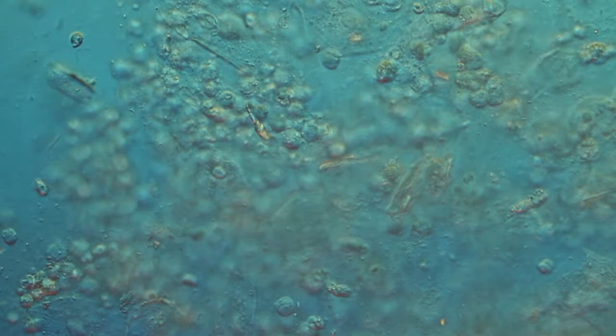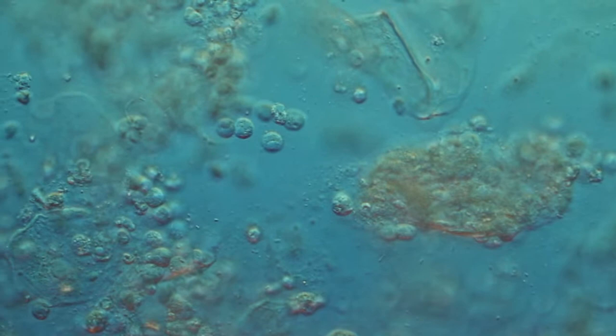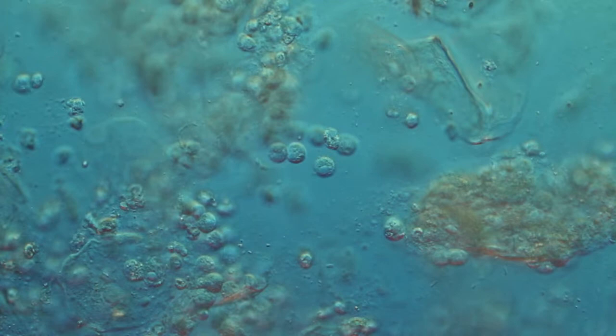Welcome back folks to episode 3 on microbes. This sample was taken from one of the most disgusting places on the human body. You are seeing epithelial cells, bacteria, and lots of round cells. What do you think they are? Where do you think they came from?